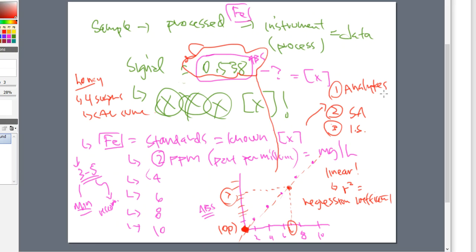Because again, the idea is to pick out a concentration that should match our expected values, and make sure that those are showing up every single time in every single sample, and calibration curves make very easy work of that. So just keep that in mind. Cal curves are not just for things that you're looking for, aka analytes, but they're also in addition to all the other things that you're adding into the solutions.